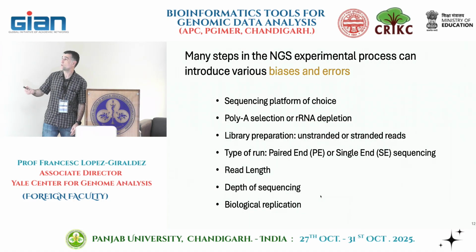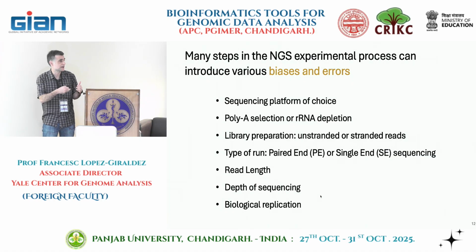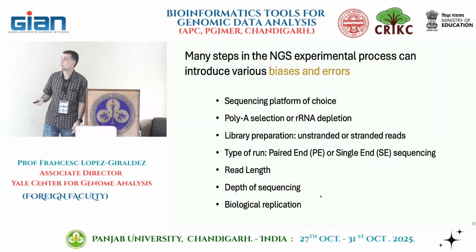Because basically all the other options we can figure out. We said Illumina machine, and we're probably going to prefer poly-A if you only study protein coding genes. For library preparation nowadays, I think the only thing we do is stranded because it's the same price. Why not use it? Same for the rest, but biological replicates always come from the investigator, who needs to be smart about it.